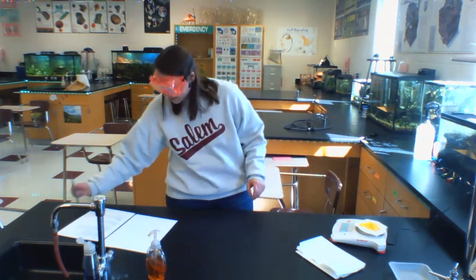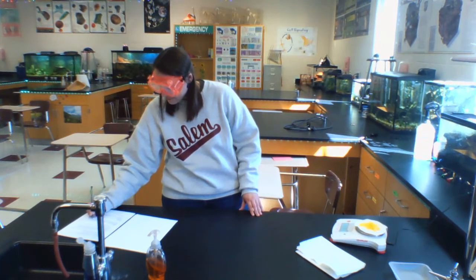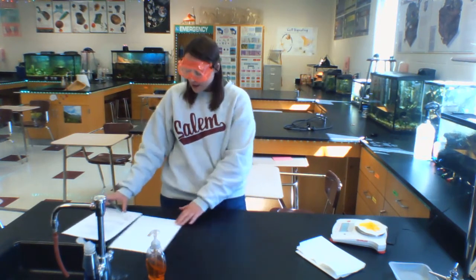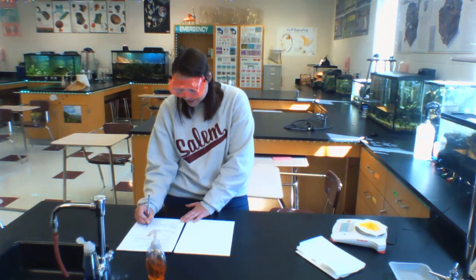My total mass with the filter paper and the product is 3.97 grams. And what I have to think about then is, how much of that 3.97 grams is the actual precipitate product and how much of it is the filter paper? Like I said yesterday, I had 0.90 grams as the mass of my filter paper. So I set up a subtraction problem: 3.97 grams minus 0.90 grams, and I get an answer of 3.07 grams.